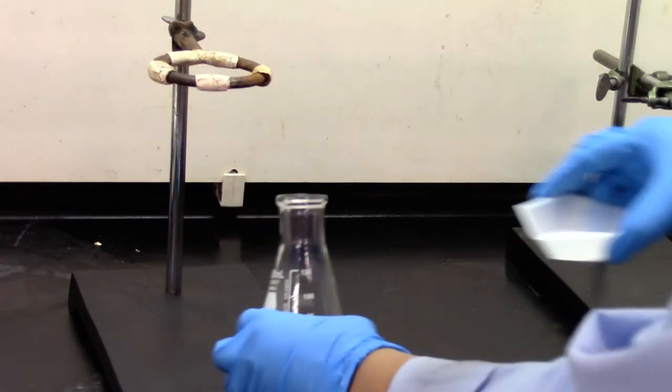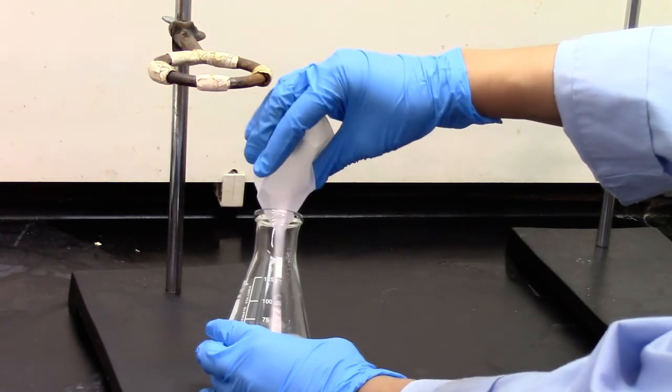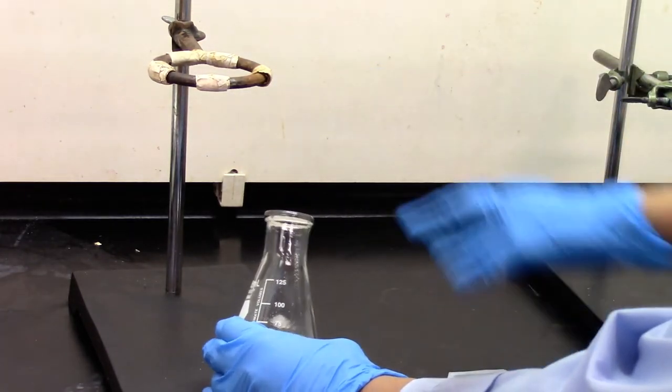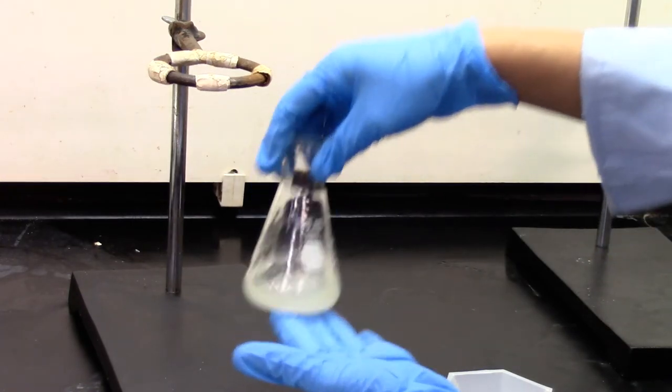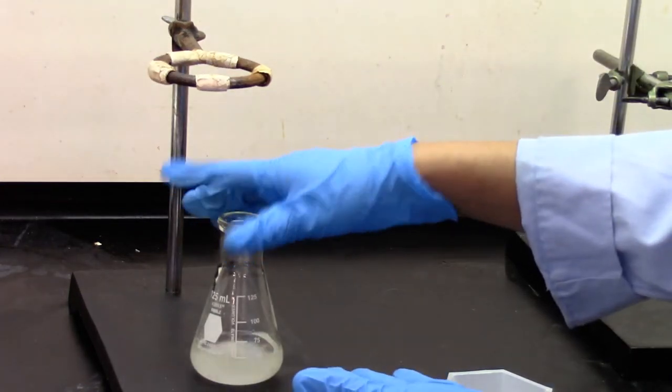To the dichloromethane layer, I'm going to add about 2 grams of sodium sulfate, anhydrous sodium sulfate. And then give it a mix. Let it stand for a few minutes.